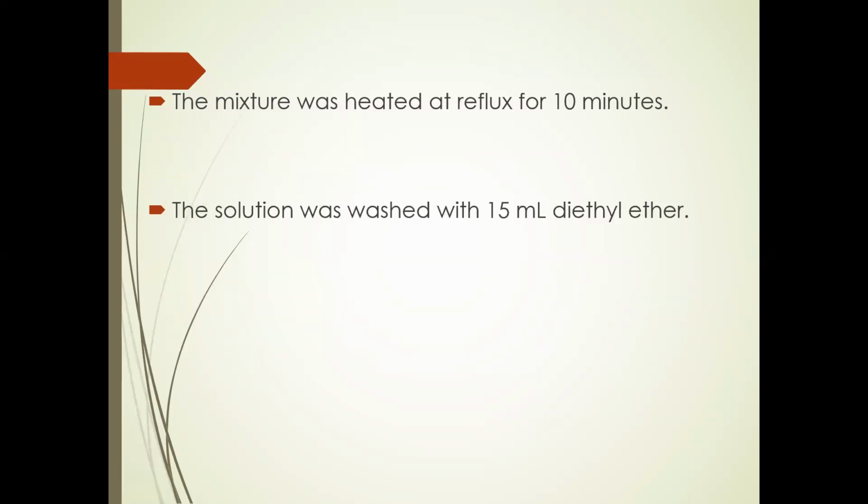Likewise, if you do an extraction or if you wash something, it's sufficient to say it was washed with 15 mL of ether. You do need to state the volume that you used and the solvent, because we could wash with 20 mL and use something else like methylene chloride or ethyl acetate. So you do need to specify those, but you do not need to tell someone it was done in a separatory funnel, that you swirled the layers and that you separated them. All of that is understood when you say washed. You don't need to give any more detail than that.